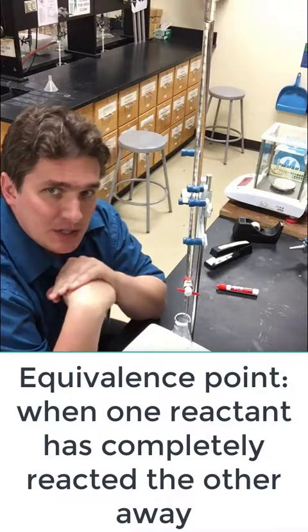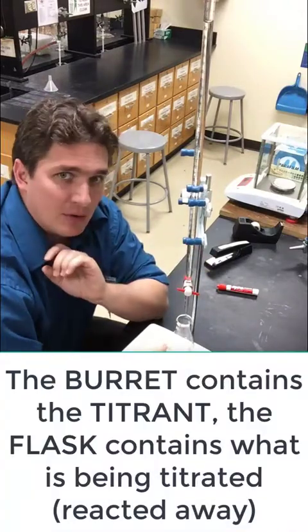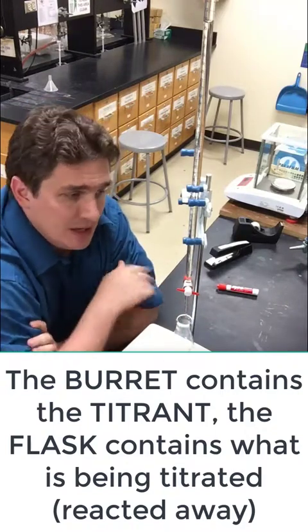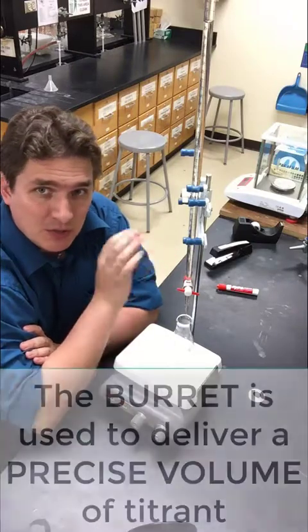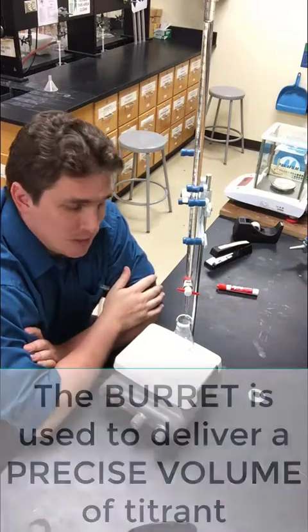So we have two pieces of glassware we use when we do a titration. We have a burette, and then we have our reaction flask. And within our burette, we have our titrant. Now the whole point of having the burette is to deliver a controlled volume. So this is precise, usually to 2 decimal points. The ones we use at Wake Tech, definitely 2 decimal points.